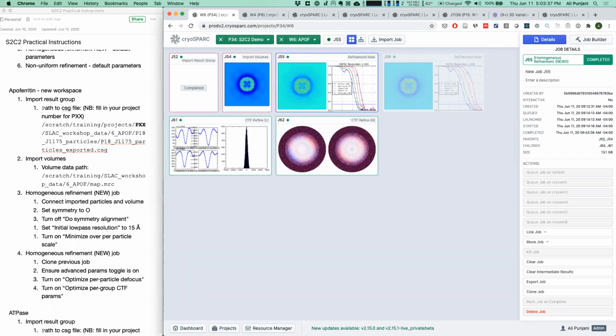Great. One question: at any of these stages, are you running into the problem of the defocus difference between the top and the bottom of a very large molecule, as David discussed yesterday? That's a great question. No, so far none of the methods we've presented deviate from the infinitely thin sample assumption, in the sense that all of our reconstruction techniques in the math involved assume that an individual particle is infinitely thin, relative to the small angle scattering assumptions for the electron beam.